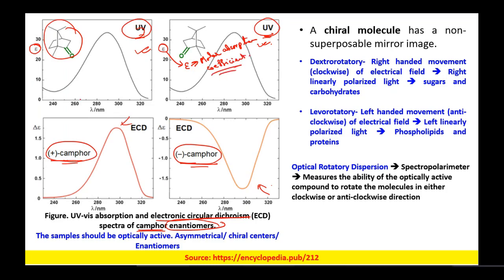Okay. However, in the case of this circular dichroism spectra, if you see, we are using delta eta or delta epsilon, whatever you call it. Let us call it epsilon, as most of you are more conversant with this epsilon term. So it is delta epsilon. So what is this delta?